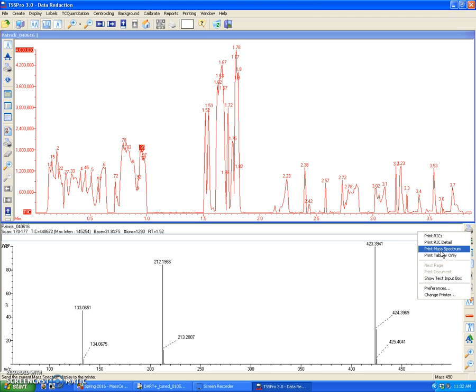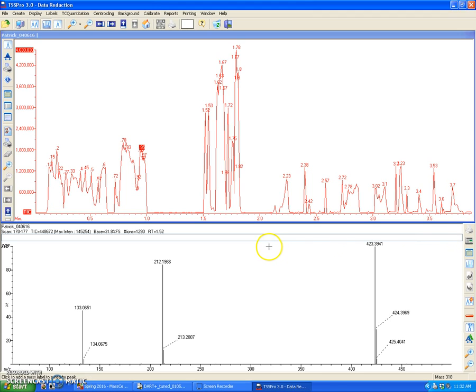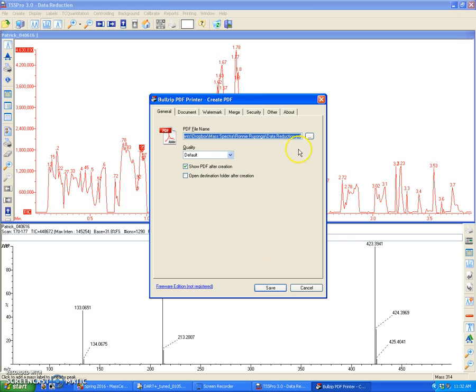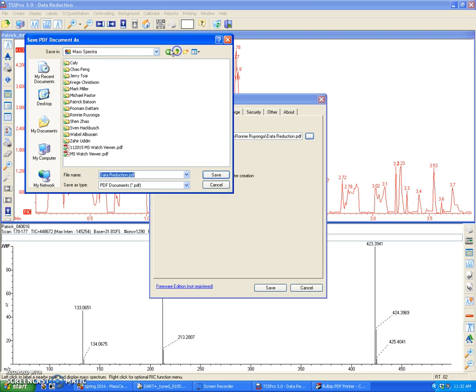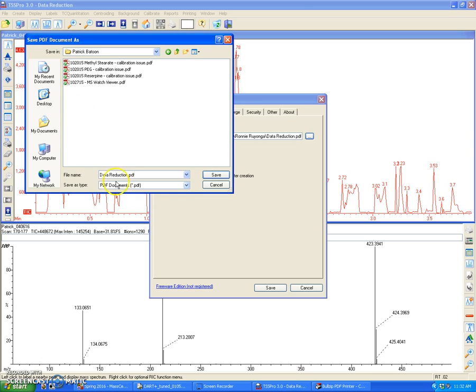Once I do that, I can save it into wherever. In this case, I have a Dropbox folder for myself, and I will label this appropriately as cinnamon-altoid and the date.